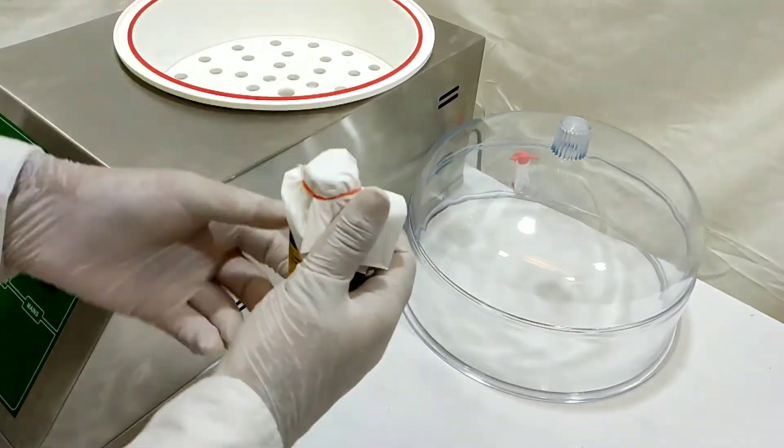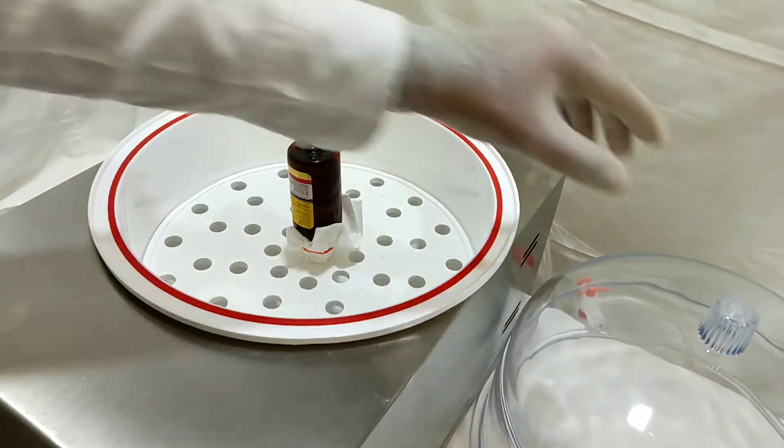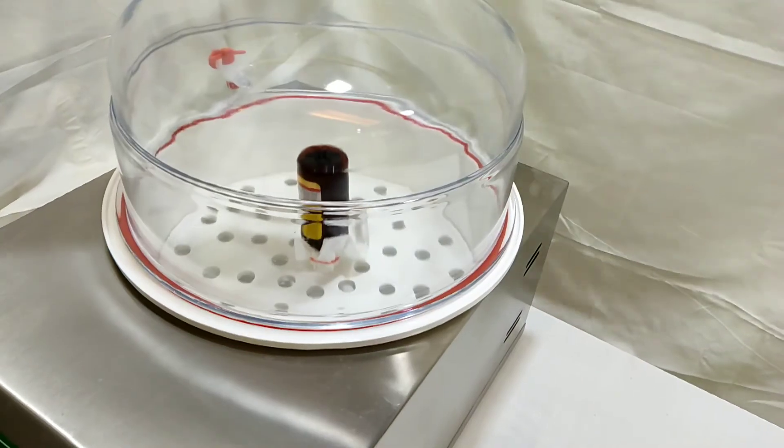Bottles can also be wet tested by submerging them in water and vacuumizing to see if they generate any bubbles in the water.